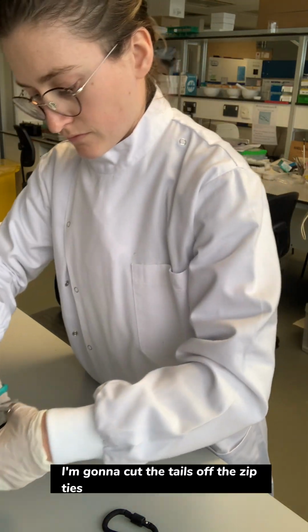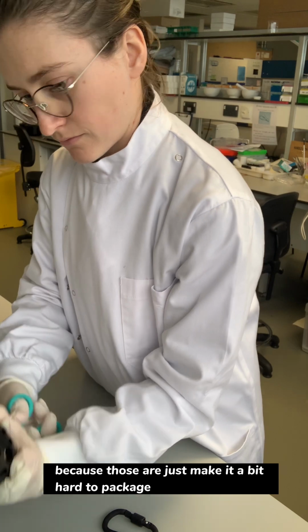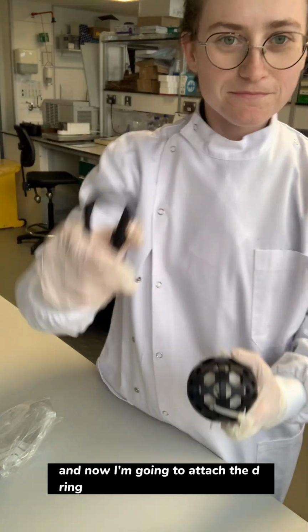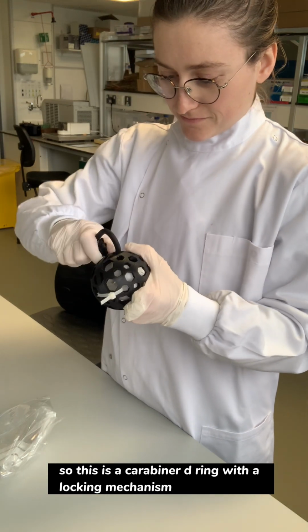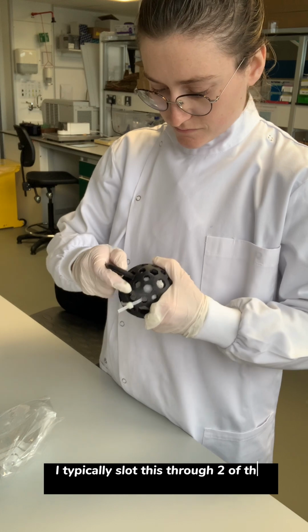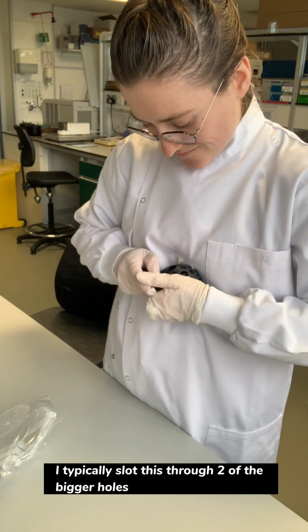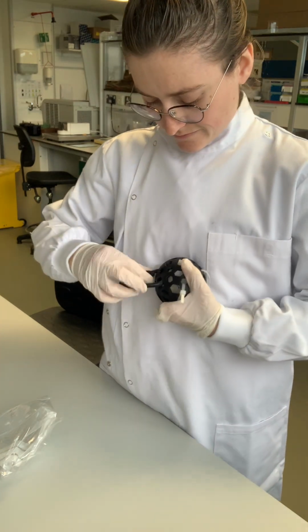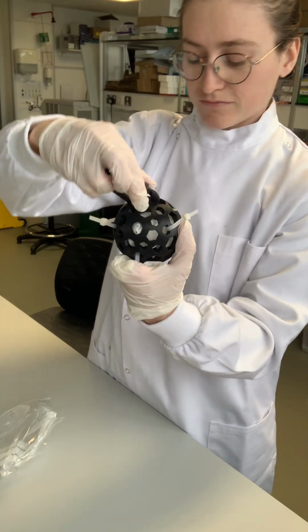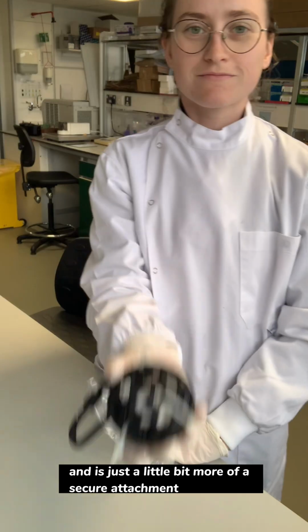I'm going to cut the tails off the zip ties because they just make it a bit hard to package. And now I'm going to attach the D-ring. So this is a carabiner D-ring with a locking mechanism. I typically slot this through 2 of the bigger holes on one side of the Metaprobe. The idea is it makes it easier to attach it on and off a line in the field, and is just a little bit more of a secure attachment. And there you go, that's your finished Metaprobe.